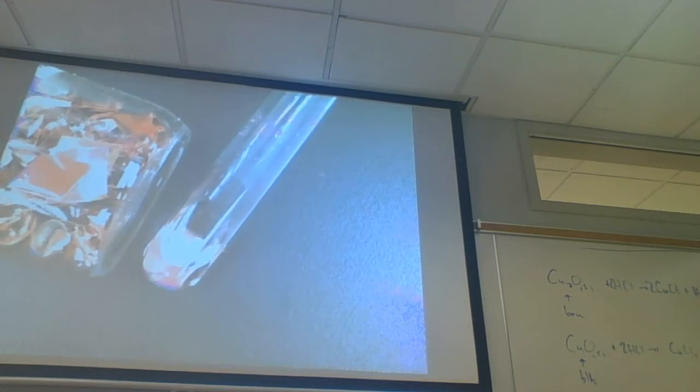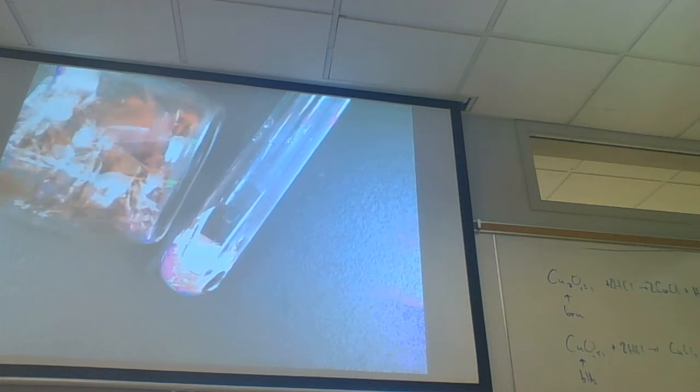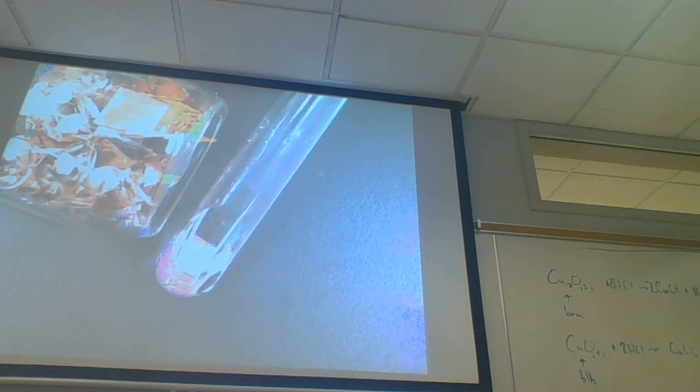So that just took off the oxide coating as a double replacement reaction. Still shinier each time. But that's not necessarily the reaction we're after. What was the reaction we're after?